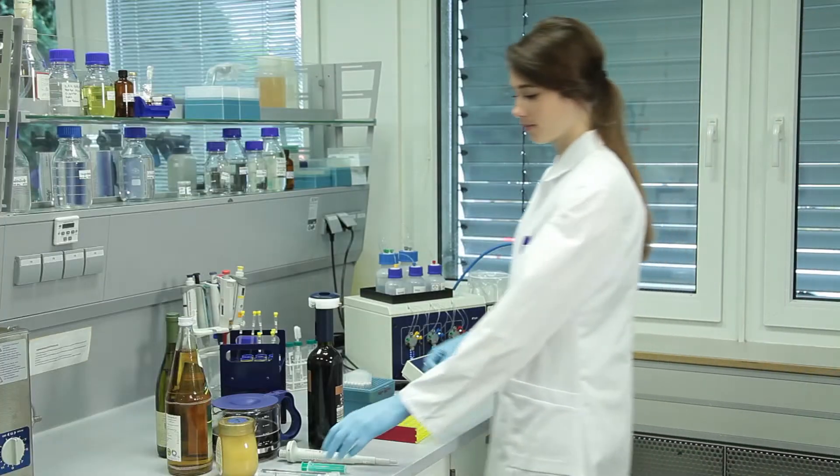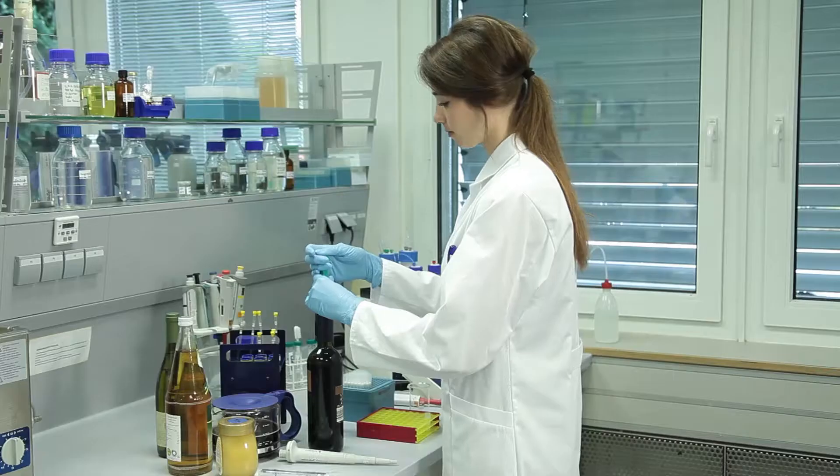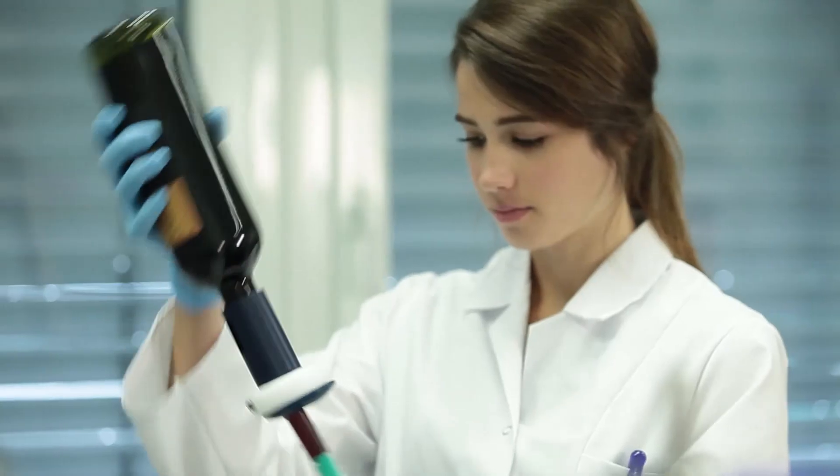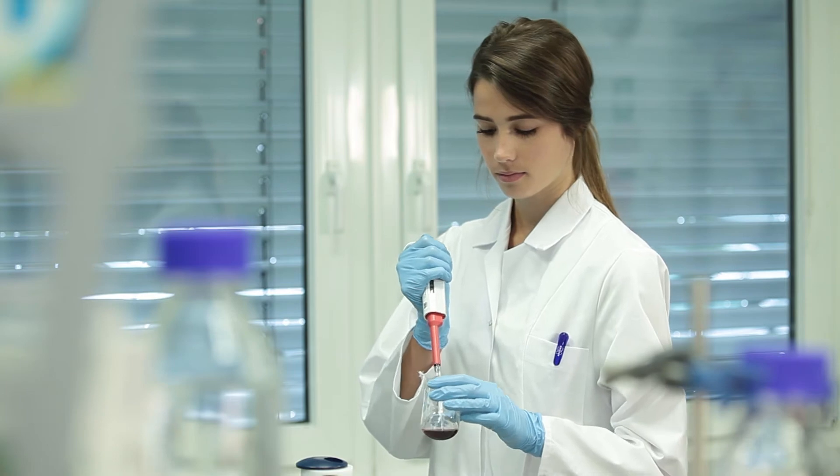Its unique targeted and non-targeted analysis allows the detection of known and even unknown deviations. The whole completely standardized procedure takes a few minutes, starting with sample preparation leading to the automatic generation of a conclusive report.